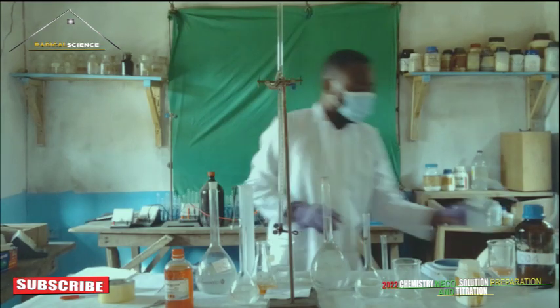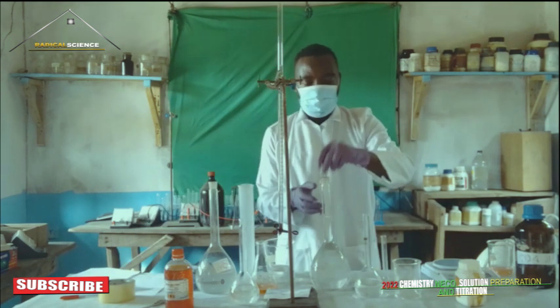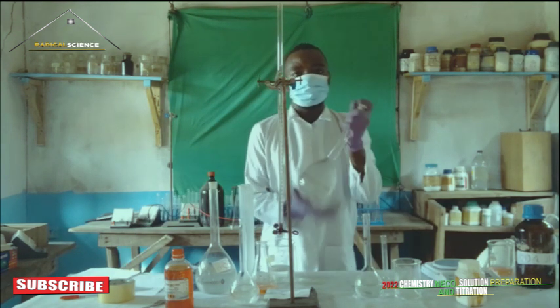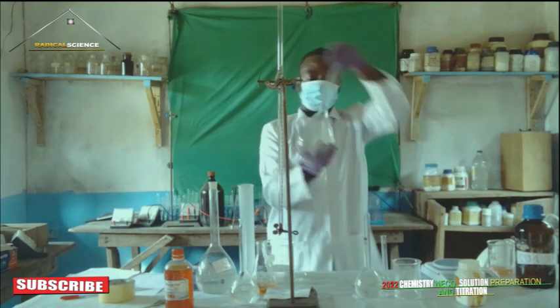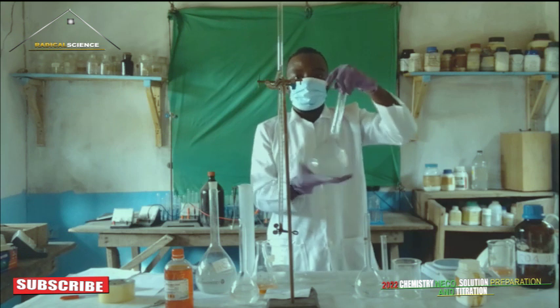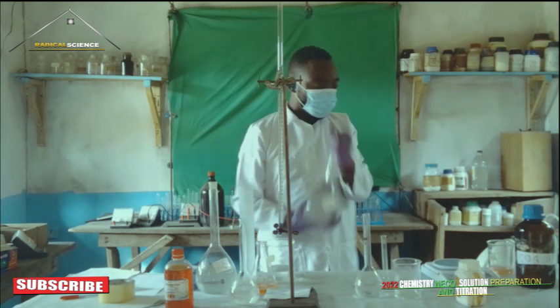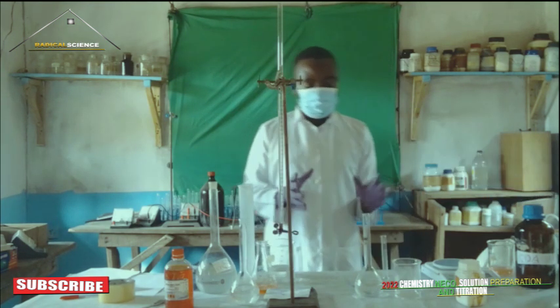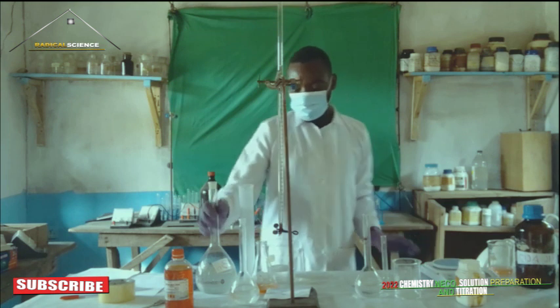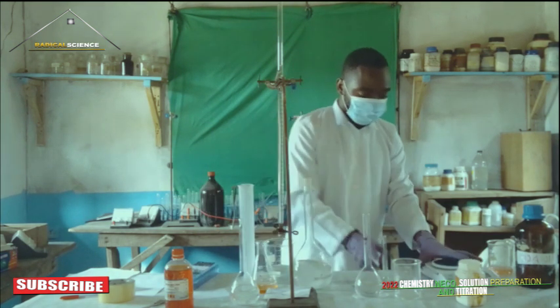Okay, so we have that. The next step is we close it and homogenize it. Now, as you can see, we have gotten our AN, which is the acid. Then we keep it aside. The next one is the base.